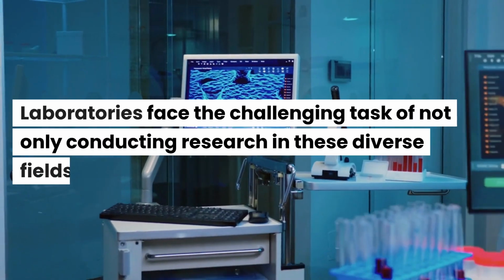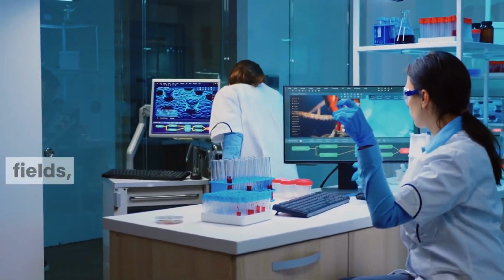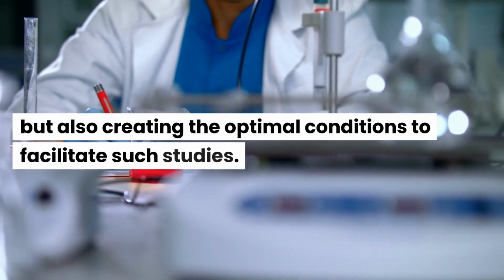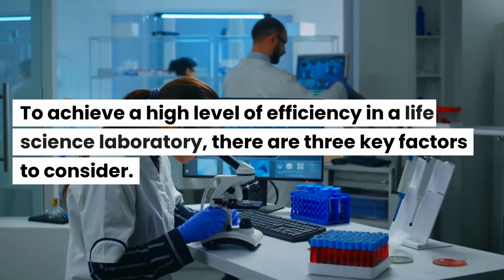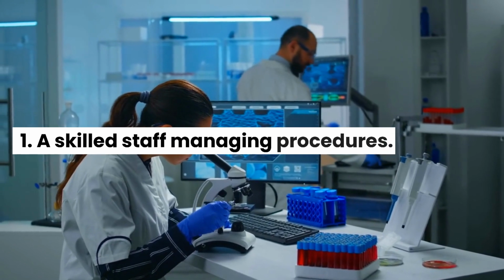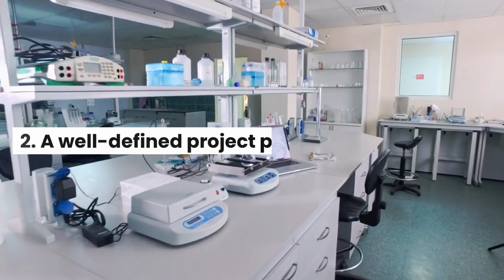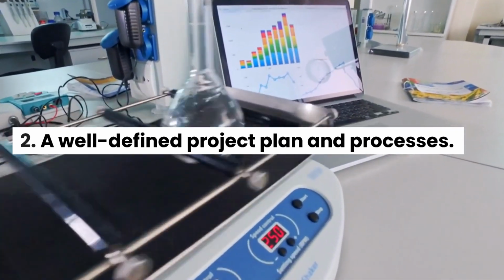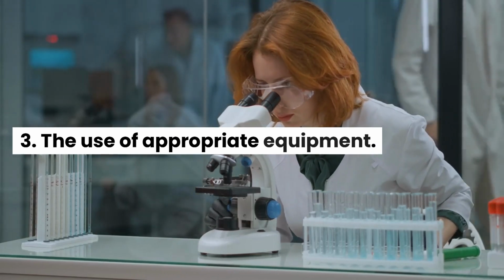Laboratories face the challenging task of not only conducting research in these diverse fields, but also creating the optimal conditions to facilitate such studies. To achieve a high level of efficiency in a life science laboratory, there are three key factors to consider. 1. A skilled staff managing procedures. 2. A well-defined project plan and processes. 3. The use of appropriate equipment.